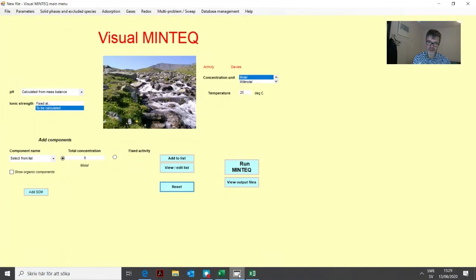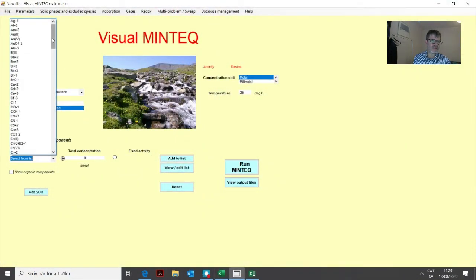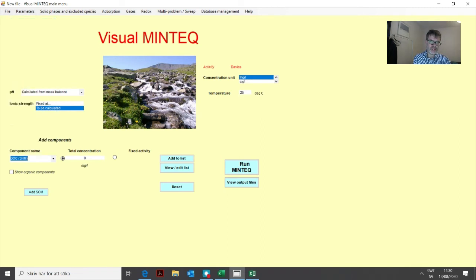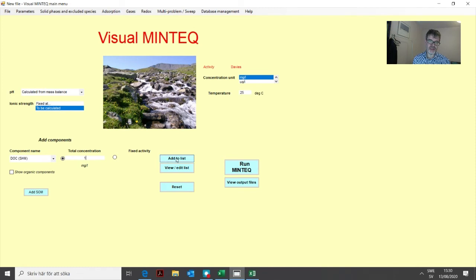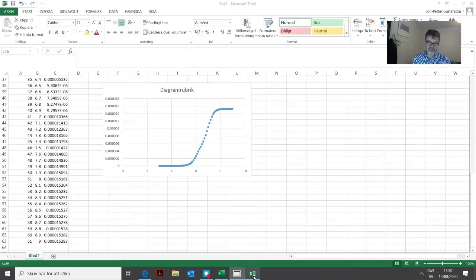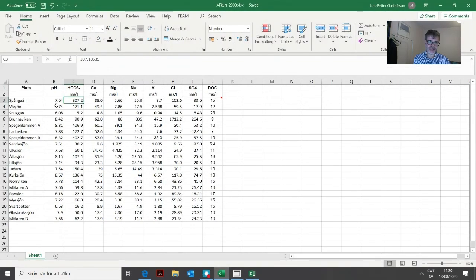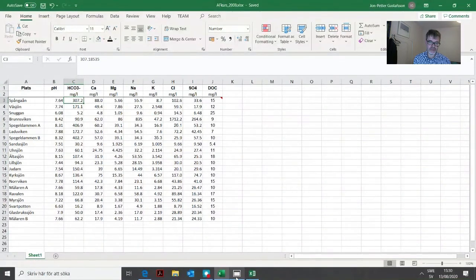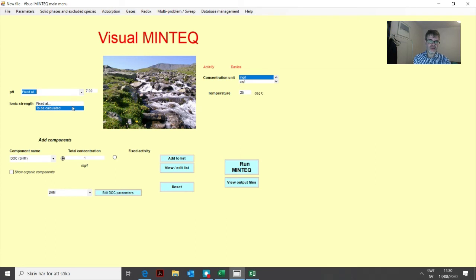We choose DOC from this list. Let's assume we have SHM, the Stockholm Humic Model. Doesn't really matter what concentration we add because that will be overwritten when we import from Excel, but we add one and add it to the list. Because we have measured pH in all these samples, we need to have a fixed pH as well, so we can just put it fixed like that.